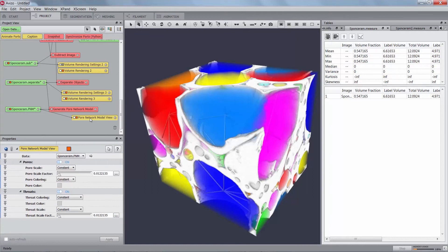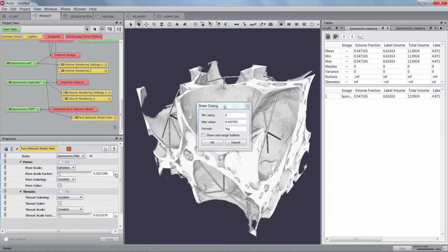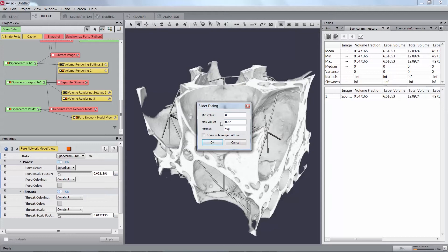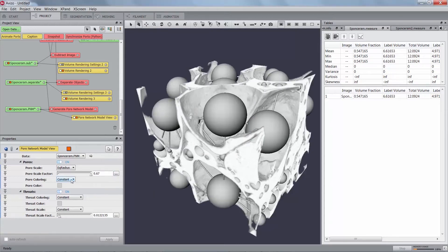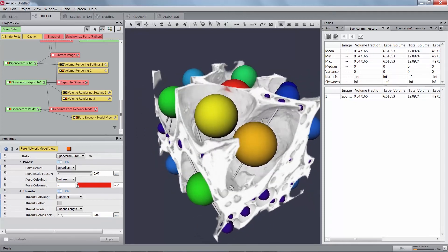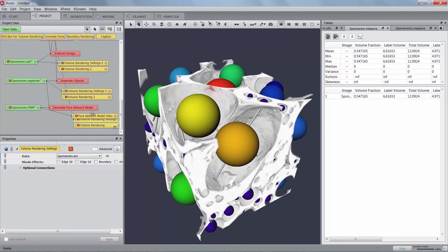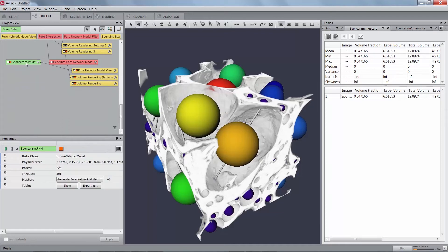Create a pore network model view on the new network and hide the volume rendering module linked to the separated data. Adjust the pore network model view parameters to pore scale being equivalent radius, pore scale factor being 0.67, pore coloring being volume, pore color map maximum value being 0.7, throat scale being channel length and throat scale factor being 0.02. You can now visualize the network in the original data. The network data can be displayed as a spreadsheet in the table panel by clicking Show of any pore network model.